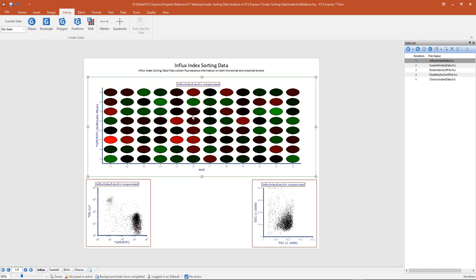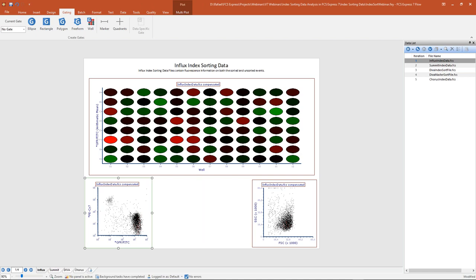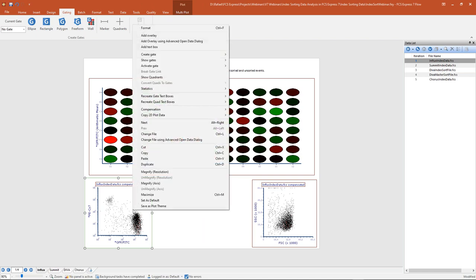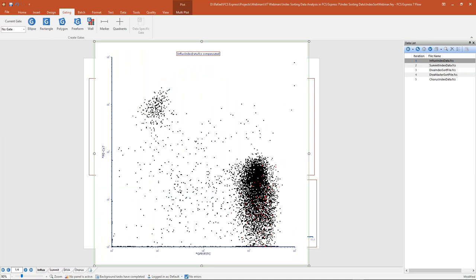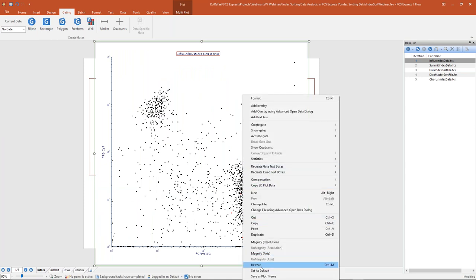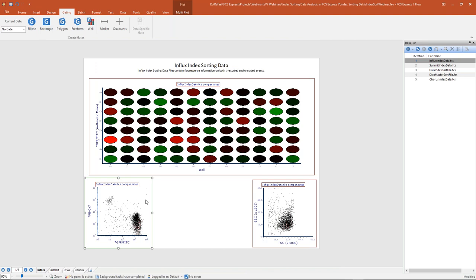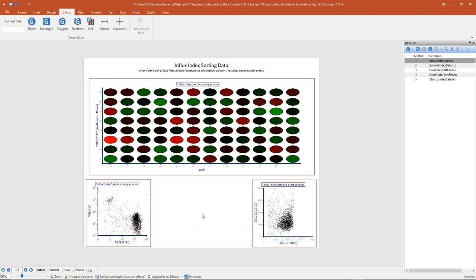Now that we've created that gate showing all sorted events on our plate, if we look down at our color dot plots we might faintly see some red dots back gating. It's difficult to pick out those 96 events because we're looking at those few events versus the entire data file. To help us visualize these rare events, we're going to use the emphasize on plots feature, which dramatically increases the pixel size of any events within our gate.